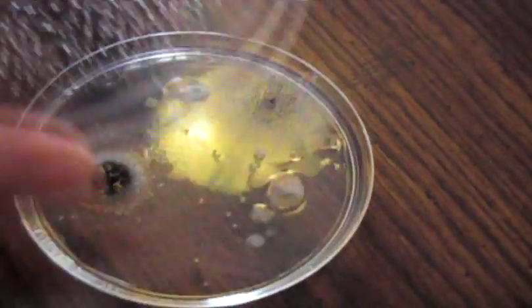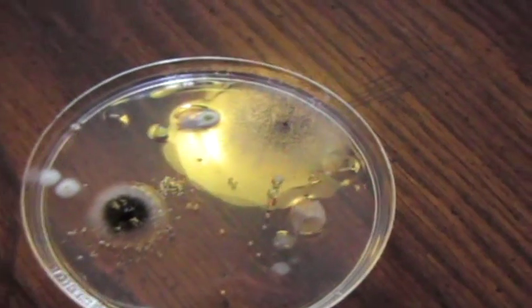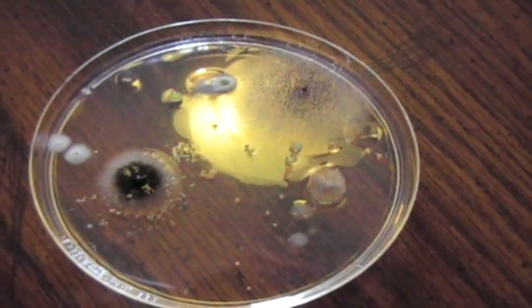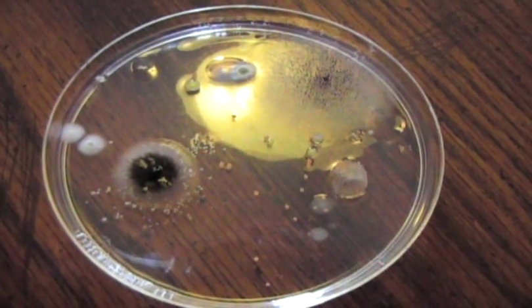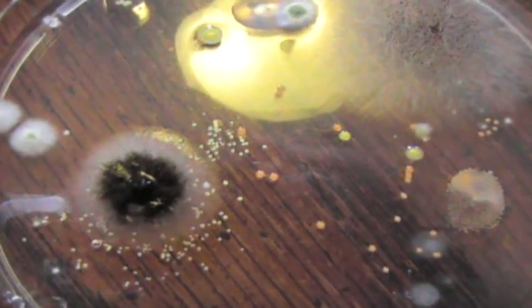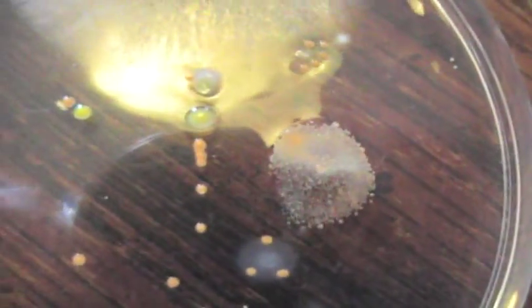This is what was on Sammy's hands before he washed them. That's gross. That is gross. And it smells pretty bad, too. Look at that. That's lots of different kinds of bacteria growing here. And you have to be careful with this stuff because these are potentially germs that will make you sick. So you want to make sure you wash your hands after you're done.